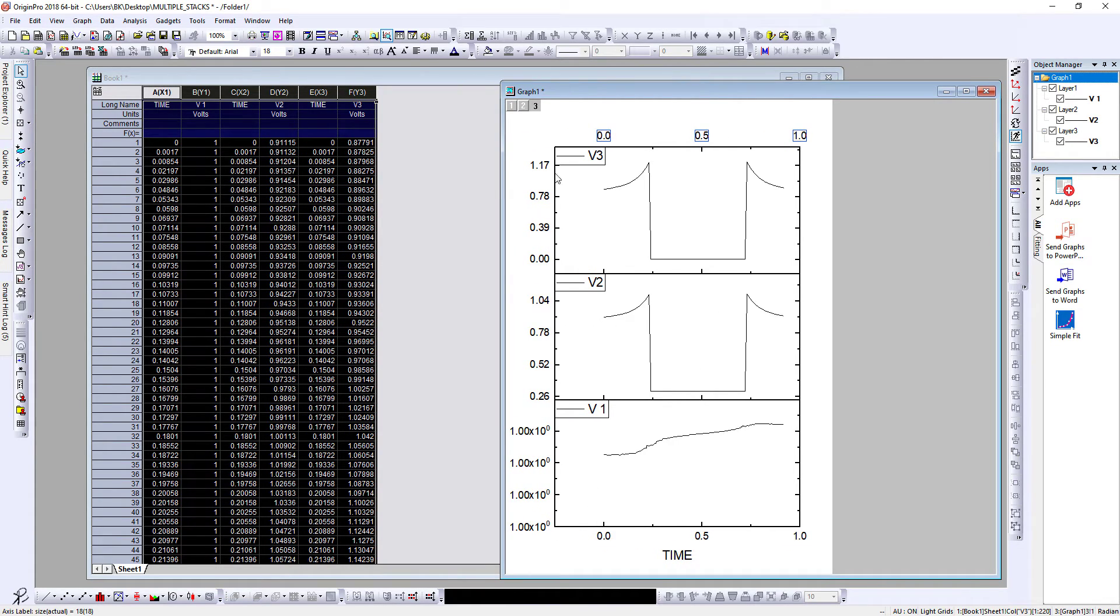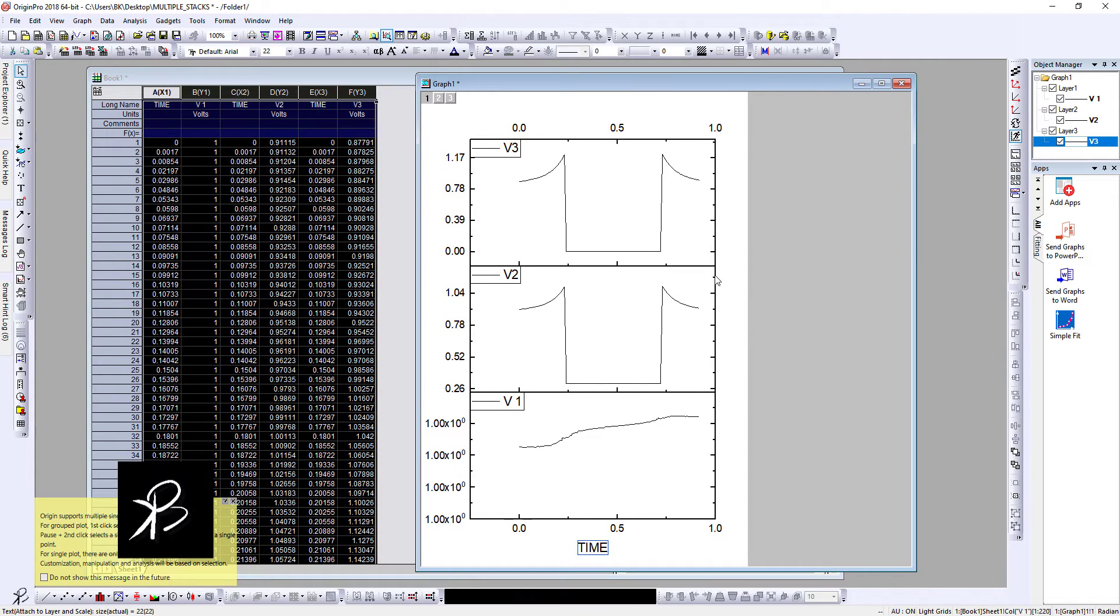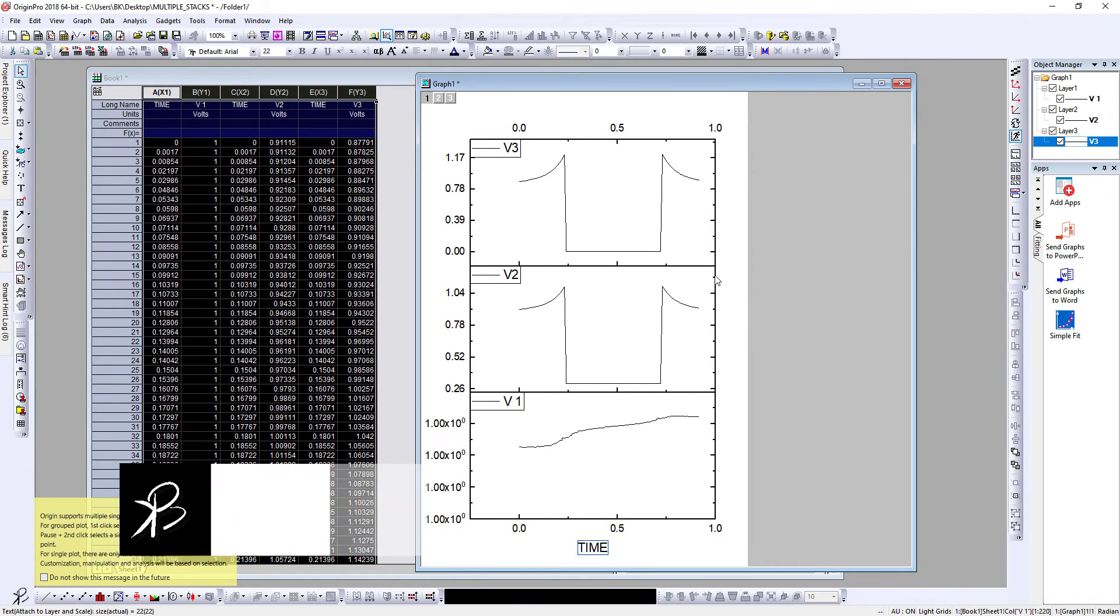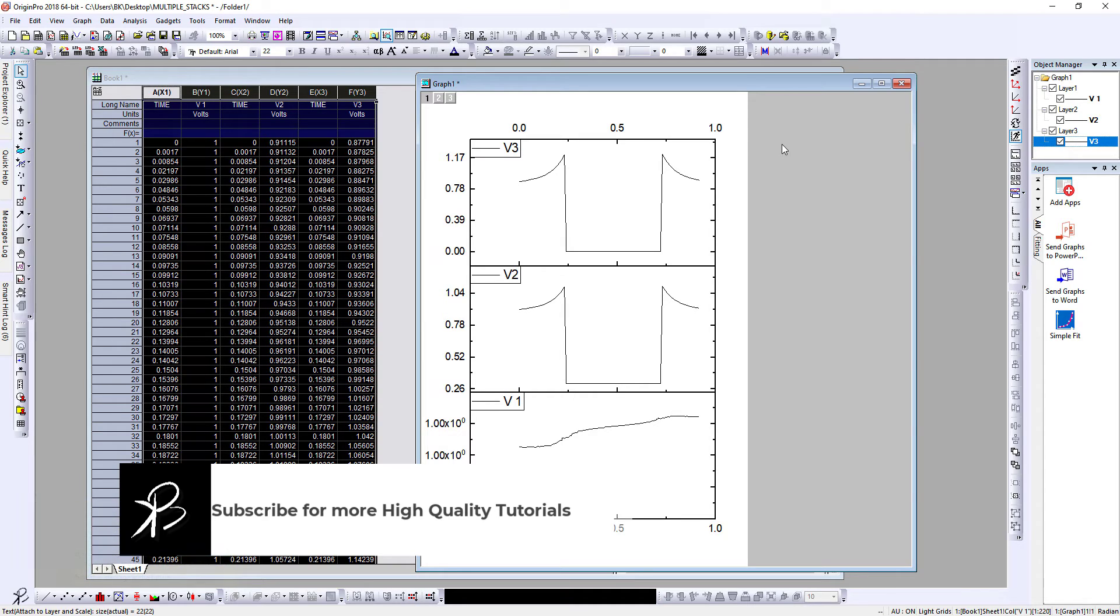So this is the data for V1, V2, and V3. And at any place you can just double click on the axis, the lines, for X and Y value, and decorate accordingly. So this is how, my friend, you can make stacks in Origin.